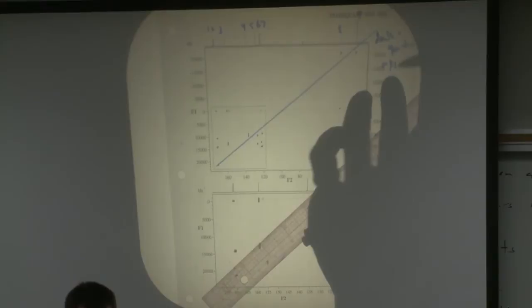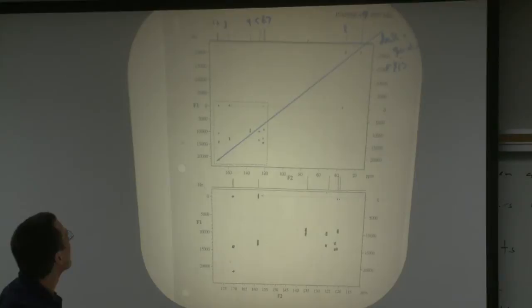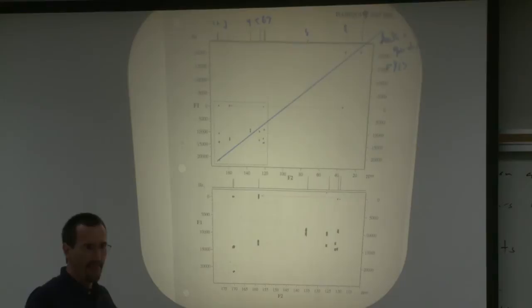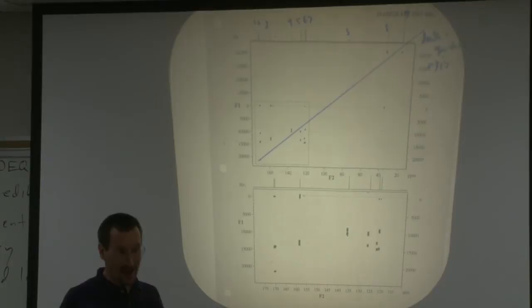Should have 10 carbons. What? Did I miscount? This here? Yeah, so that's what we were seeing with the 6 hydrogens. So what is that telling us about the 6 hydrogens? Probably not diastereotopic, probably some sort of isopropyl group in there.